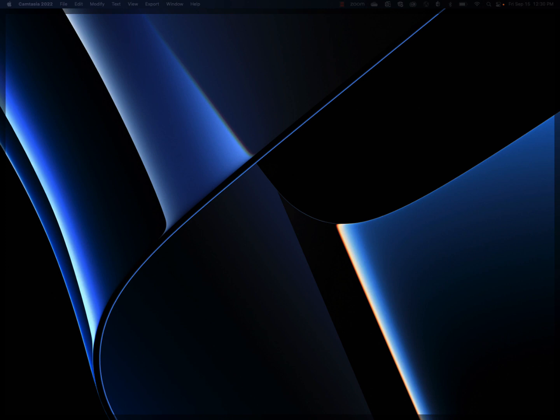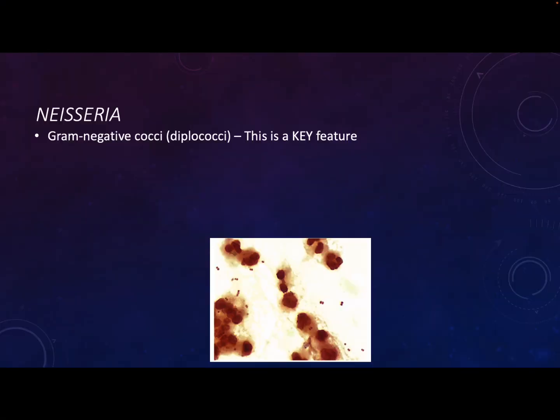Yes. Okay. So Neisseria is a really cool genus, and we are maybe going to see if some of you carry Neisseria in your throat, because that's what we are looking for on the chocolate agar. One of the really classic features of Neisseria, not clinical factors, but things you can see in the lab, is that it is one of the few gram-negative coccus-shaped organisms. Typically, if you told me you did a gram stain and have gram negative coccus, in bacteriology I'd be like, ooh, you might want to try a gram stain again, because we only gave you gram positive coccus. But Neisseria is one of the genera that is gram negative coccus, and they tend to be in a paired form. So we call them diplococcus under the microscope. That's a key feature.